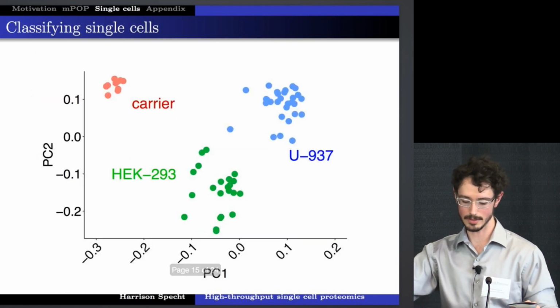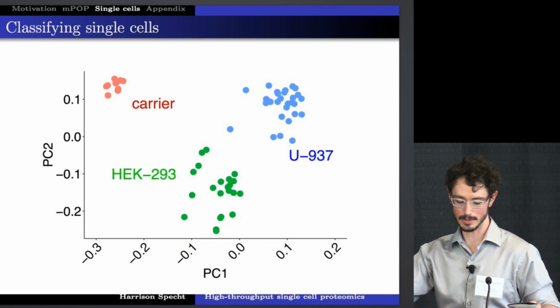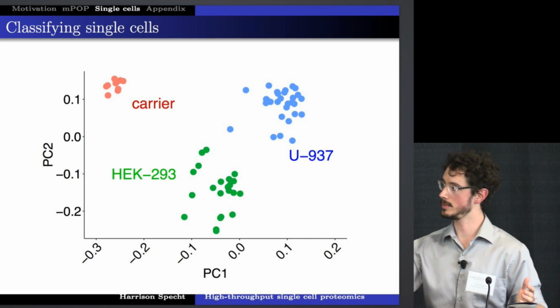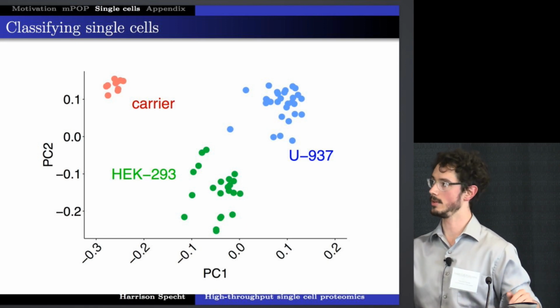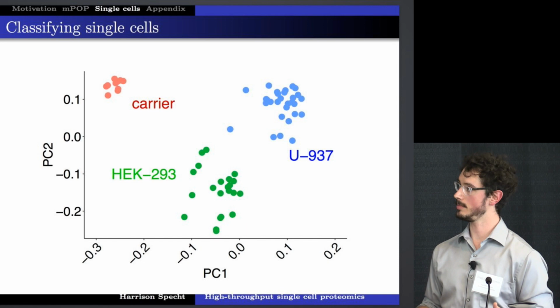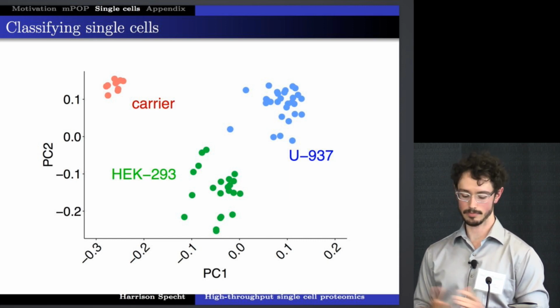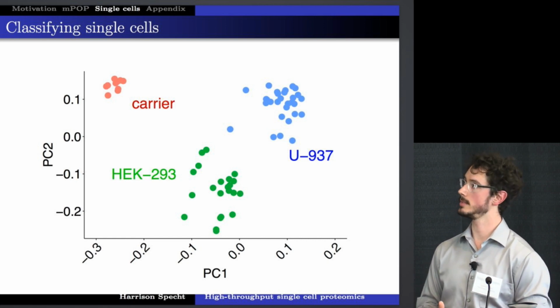And here's basically a preview, by no means a proof, of what the data showed us when we looked at the principal component loading. We took all the data from the single plate and removed the empty wells, because that would result in too much imputation. Then we blinded ourselves to what types of cells these were. We processed and normalized them across the 12 different sets using a reference channel on a similar scale as the single cell intensities. Then we calculated the PCA components, reapplied the cell labels, and looked at who was clustering with whom.